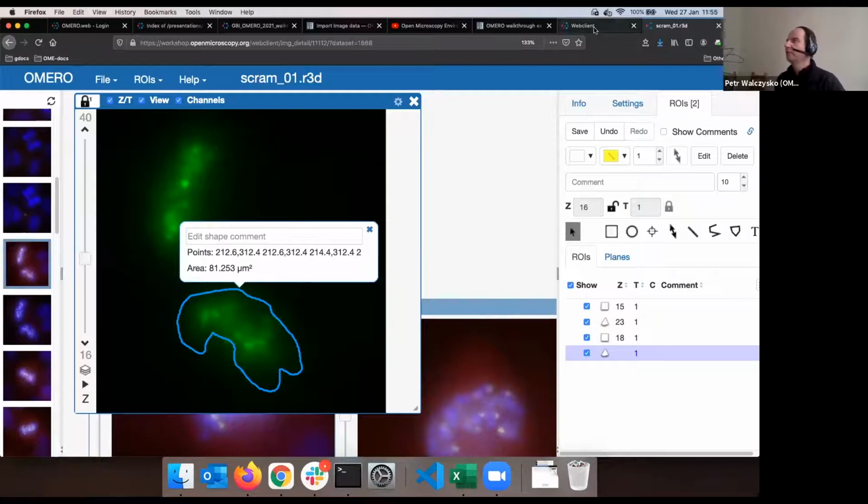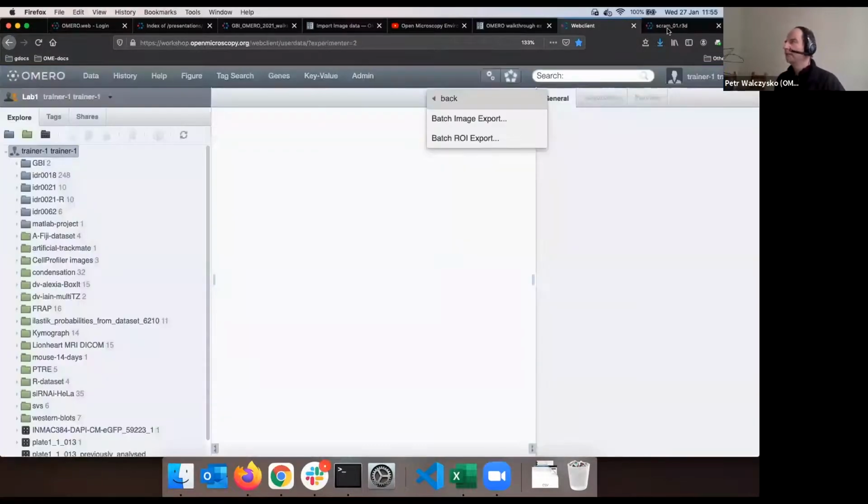Otherwise, I will go back to the web client. I think we plentifully explored iViewer. And there is, of course, a link to the guide in your walkthrough. Let's go back to the OMERO web client. Yeah, this is the OMERO web interface where we started our journey from.